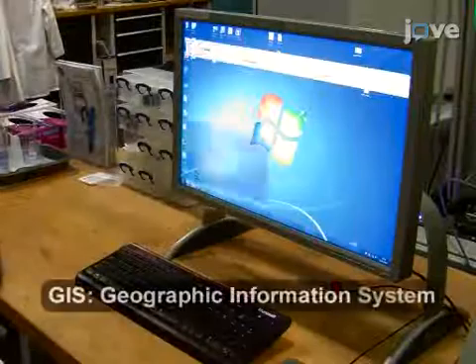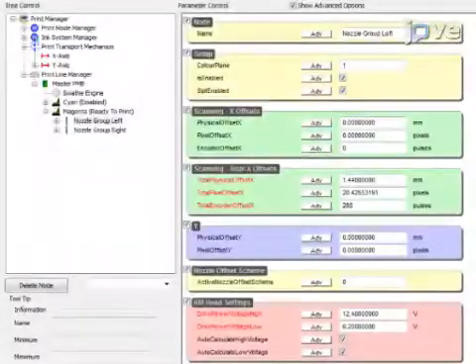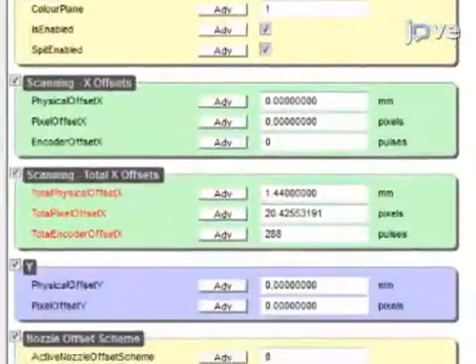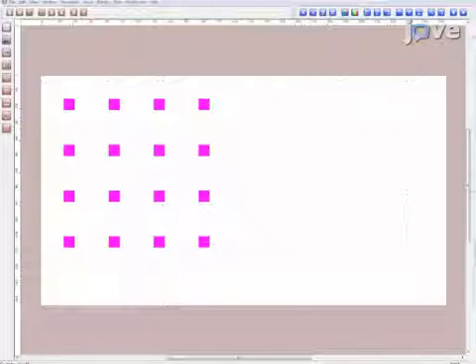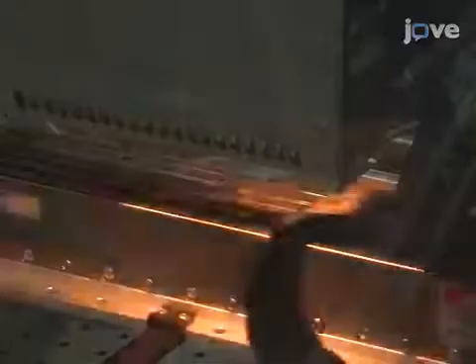Using the GIS software on the printer's computer, connect to the print server and set the waveform and printing parameters. Select and load the desired pattern and then print it onto the glass substrate according to the manufacturer's instructions.